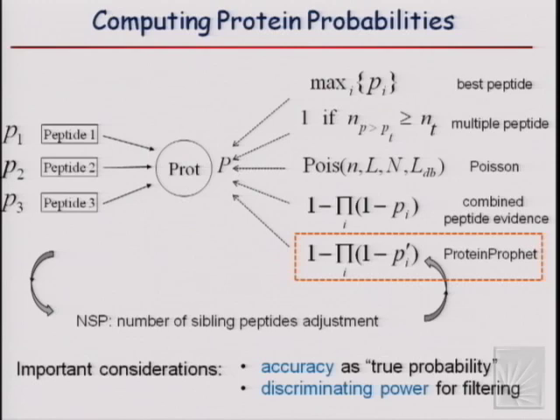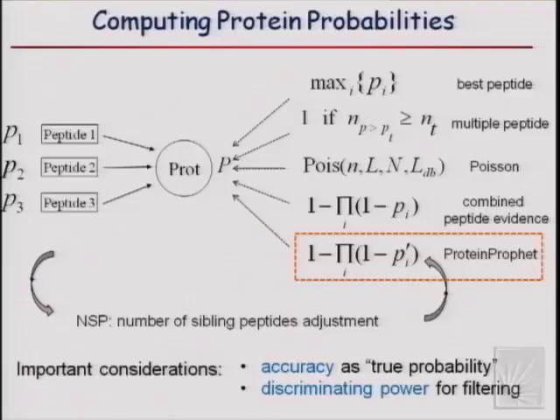It's because the tools that we developed and thought were really great and working fine a few years ago, I realized that they're starting to break apart in terms of the model assumptions when we really push the envelope and apply them to very large data sets. And APMS data are often, by definition, large data sets because you take multiple baits. If you want to profile a network, a large network, you basically select a lot of baits and you do it in replicates. And often you have negative controls. So you are dealing with multiple repeated measurements of the system.